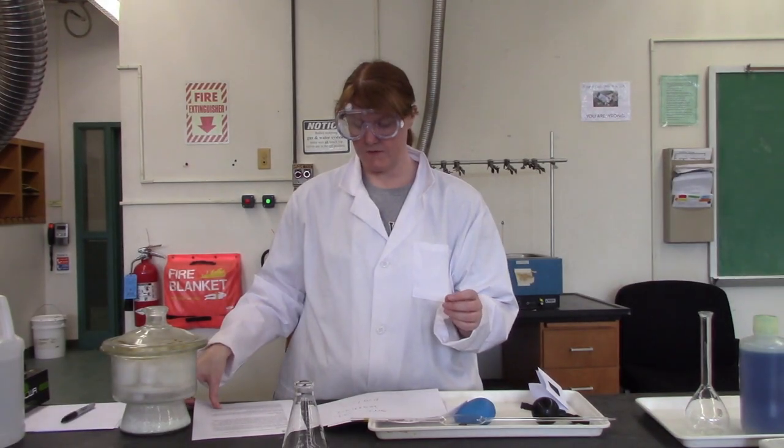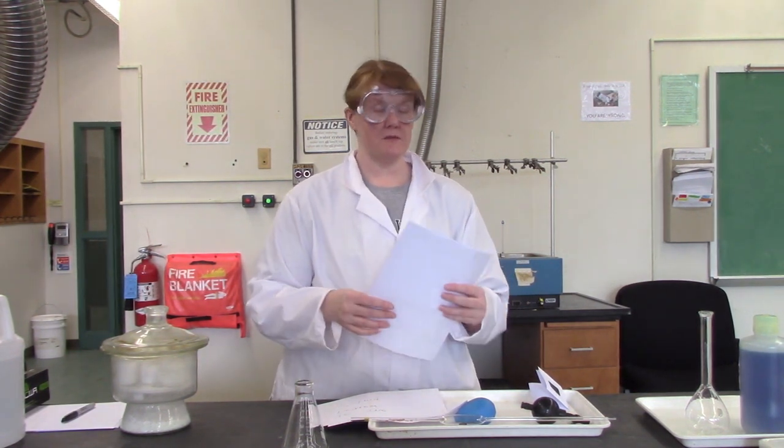Okay, so I'm going to talk to you today a little bit about experiment number 5, the determination of the percent acid in an unknown. This is a titration experiment, which maybe you did in high school, maybe you didn't. Either way, I'm going to go from the beginning all the way through the procedure and explain the methods that you're going to be using.